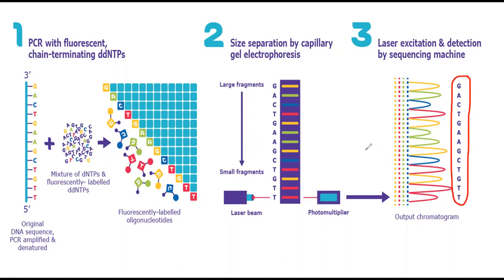It will take about 2 to 5 minutes, and after that, your nucleotide sequence will be compared with hundreds and thousands of sequences of microorganisms. And when it gives a 100% match with a microorganism, there will be a name of that microorganism, and then you will be 100% sure that you are dealing with a specific species of a Pseudomonas.